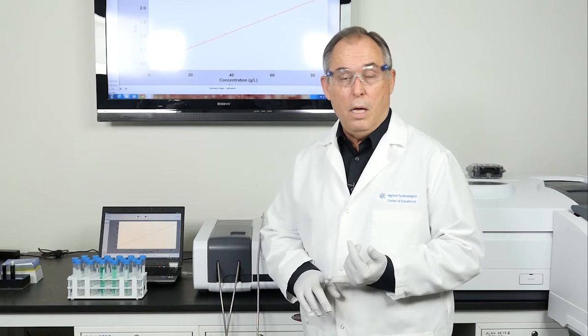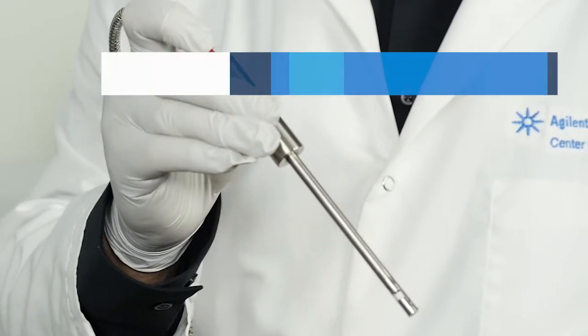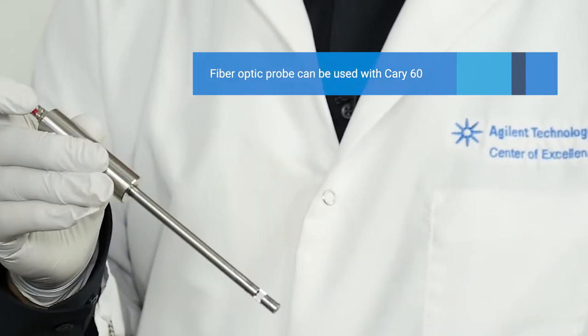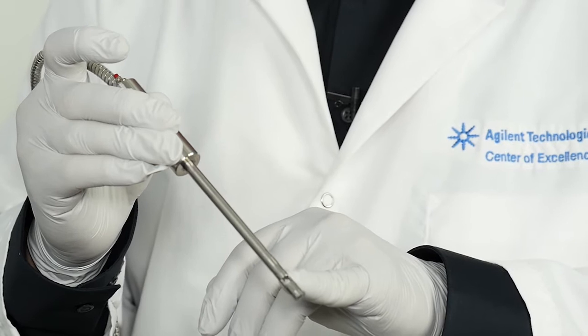An alternate way of running a lot of samples is to use a fiber optic probe. It can be remotely triggered while you're running the sample, but the most important thing is that you have a defined path length.